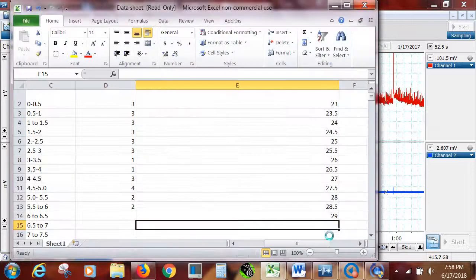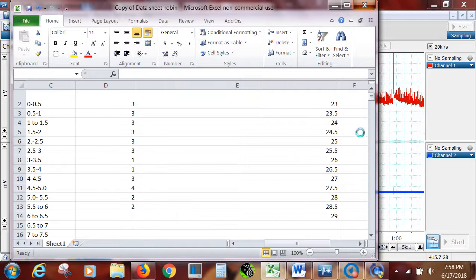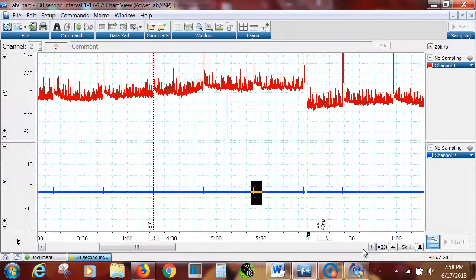Isn't that weird? Okay. Anyways. And then you can do the next one, next one, next one. Okay, so I'm going to close out for now. Do we get the idea with this?